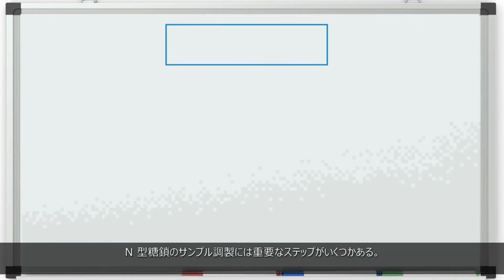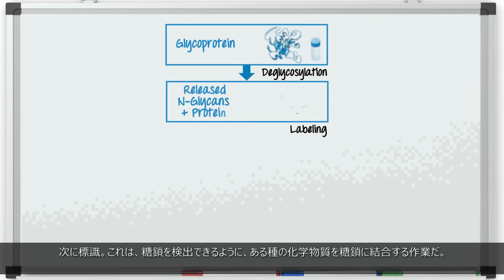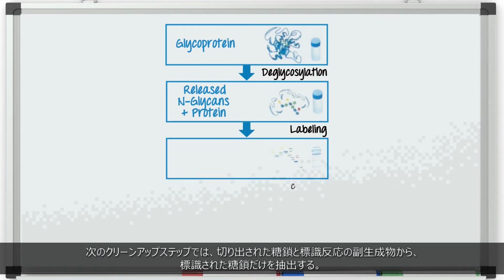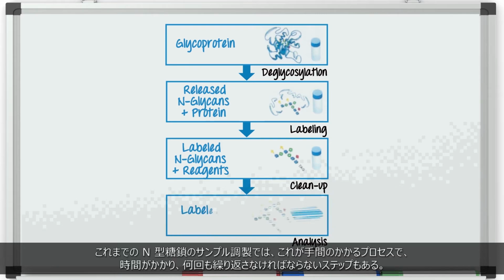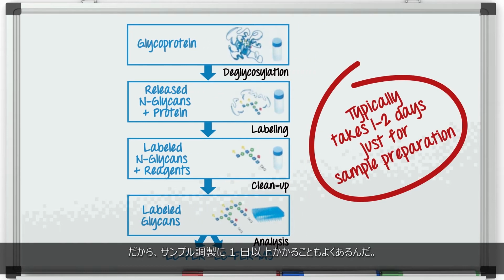N glycan sample prep consists of several key steps. Deglycosylation, in which glycans are released from a glycoprotein. Labeling, in order to introduce some chemical entity to the glycans so that they can be detected. And a cleanup step to extract the labeled glycans from deglycosylation and labeling reaction byproducts. In a conventional approach to N glycan sample prep, this process is laborious due to lengthy procedures and that some steps have to be iteratively performed. The end result is that the sample prep time often amounts to something greater than 1 working day.